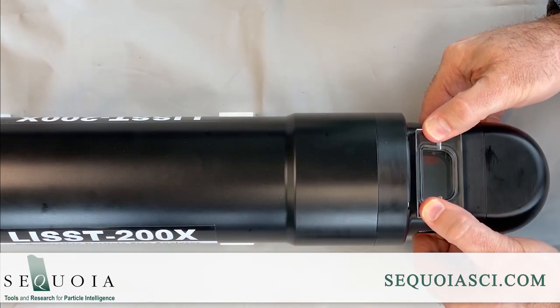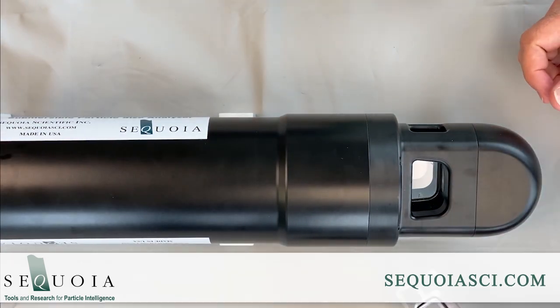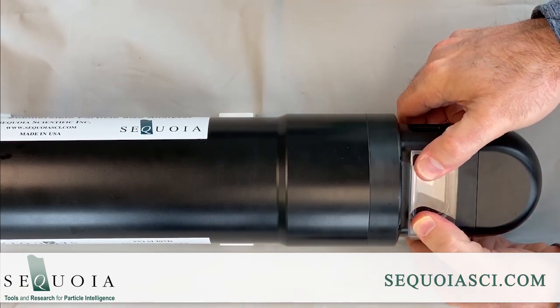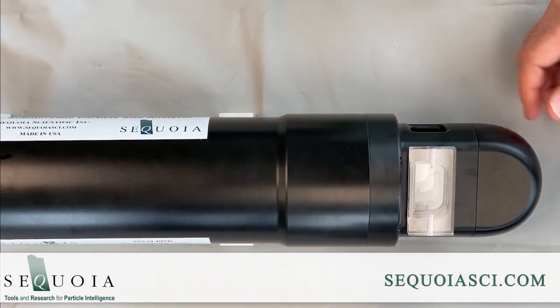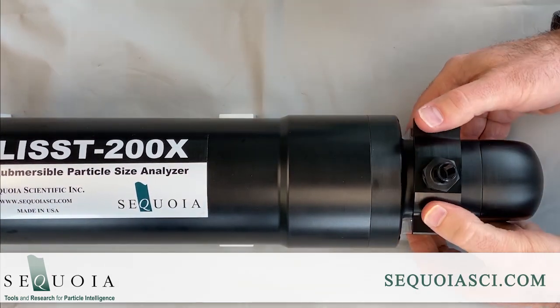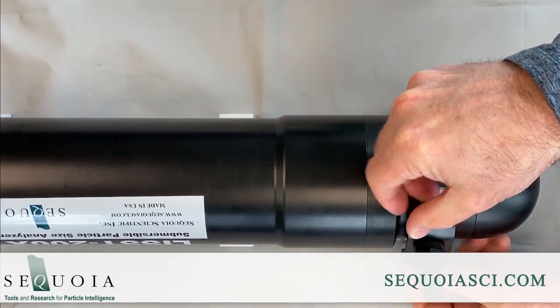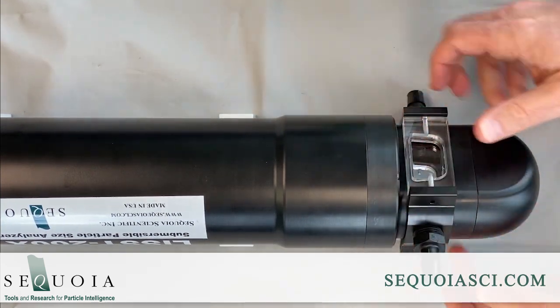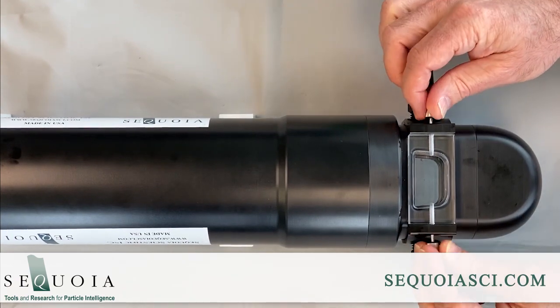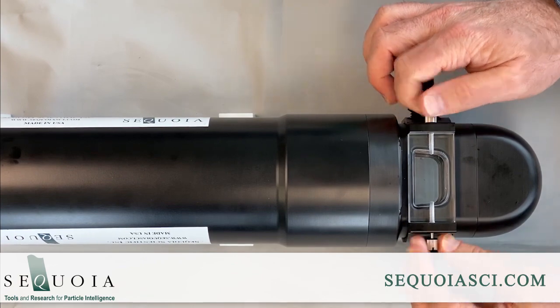Insert the clear acrylic parts into the larger openings using your thumbs to push them fully into place. Note that these parts can only be inserted in one orientation, but will fit on either side. Insert the black parts into the smaller openings. Install the 2 screws on one side, but do not tighten them fully.